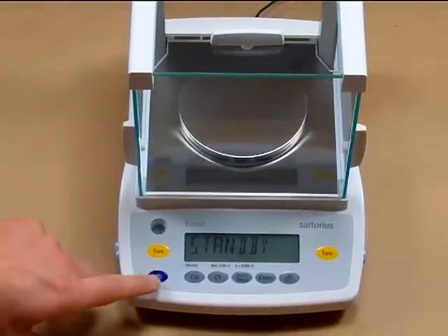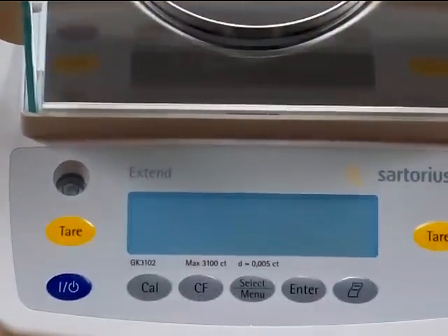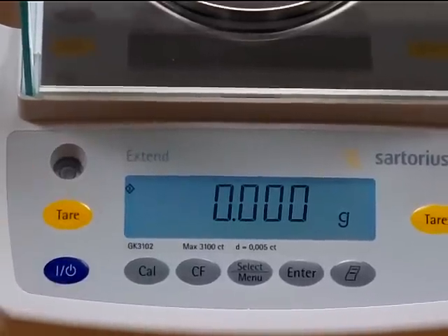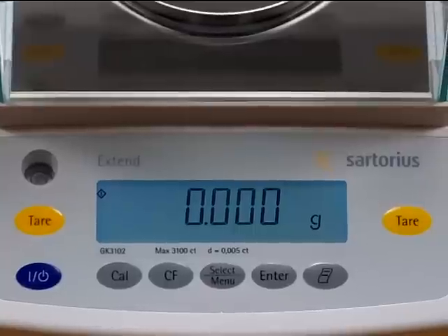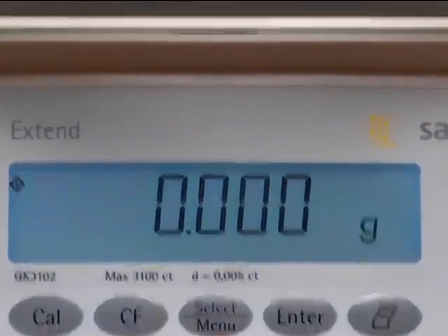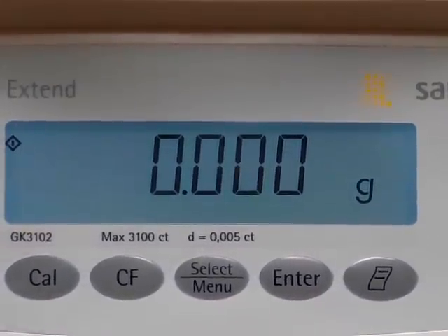Let's turn on the balance and take a closer look. The balance features an LCD with backlight display for easy viewing under all lighting environments. You'll see this is a three decimal place balance — it reads 2.001 grams.